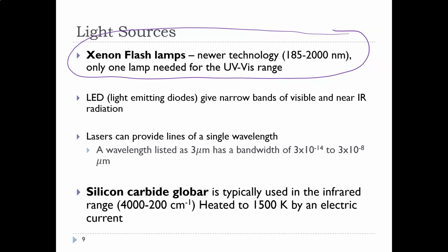These are just some other options for UV vis. The LED lights, those work. Lasers can work. Both of those are very narrow, though. They wouldn't have the entire range. But this is another answer to know.